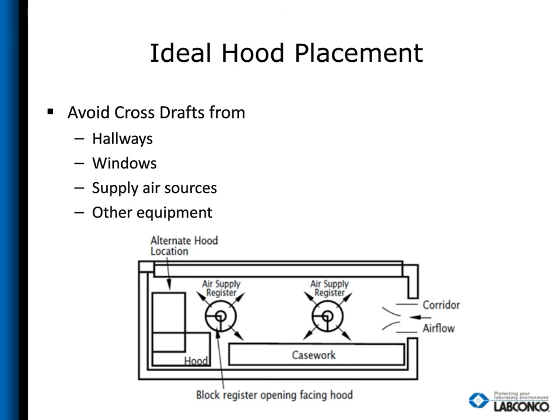Don't put your fume hood next to the hallway. Don't open any windows in the lab. Don't work quickly in your hood. You yourself could create a cross draft. Don't open and close the sash quickly. All of these things help with fume hood containment. And what does that help? Your safety. And that's why we're all here, for your safety.